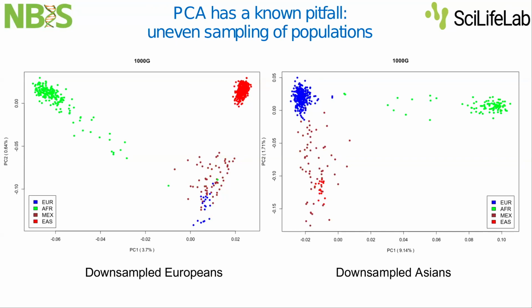Yeah, exactly, so exactly what you said. If you want to project a cell population to an already established atlas, please at least keep in mind this effect on where your query cell population can end up. If the position is actually important for you, like for functional interpretation, maybe you want to say that my query population is closer to that cluster, that's why these cells are functionally closer.